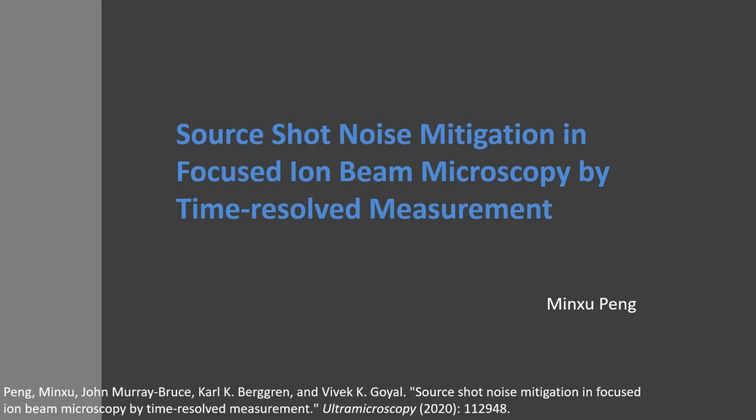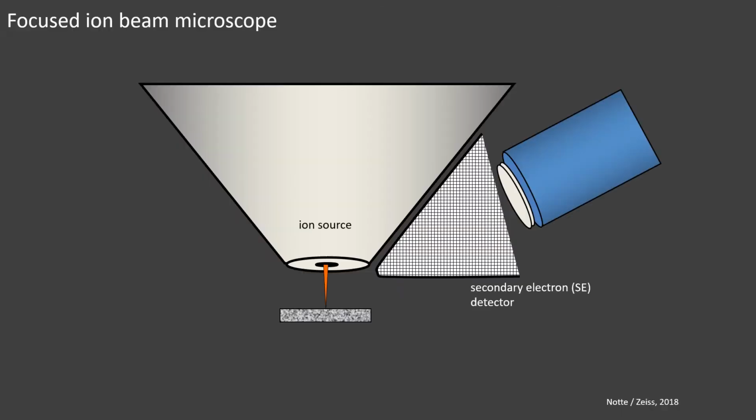Today I will talk about our work on shot noise mitigation in focused ion beam microscopy by time-resolved measurement, which was recently published in the Ultramicroscopy journal in January. What's the structure of the microscopy?